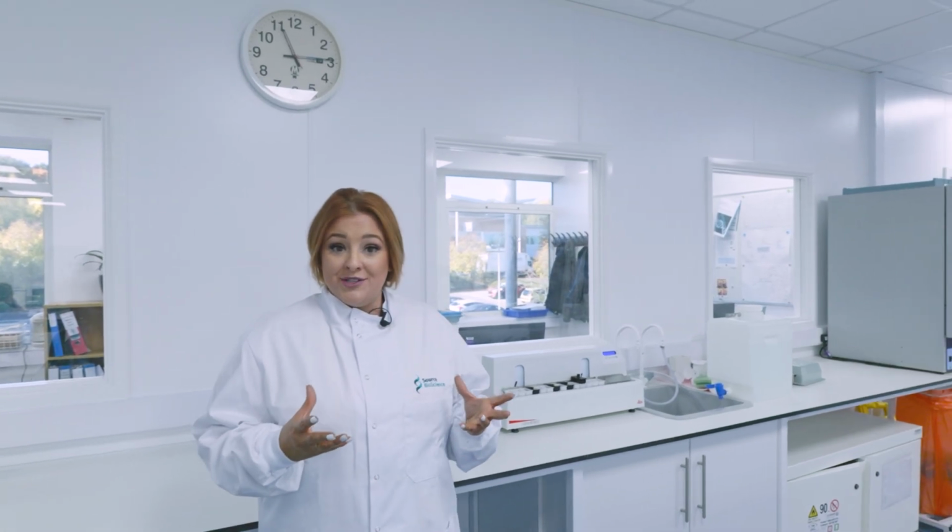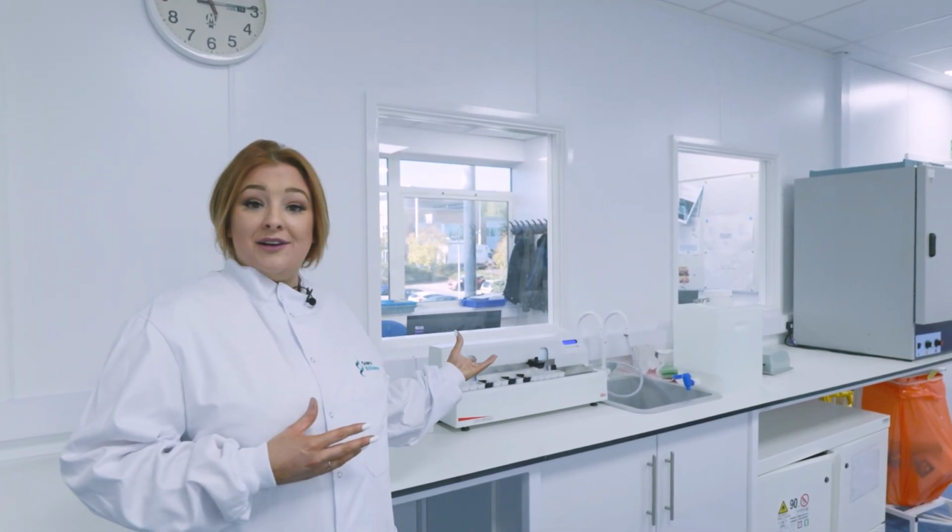So once we've got our unstained slide, it then gets sent down an H&E stainer. So this allows us to have a look at the tissue architecture and also to identify invasive tumour and areas of interest. This allows us to do tumour burden review for mutation analysis. It also allows us to know whether we need to macro out certain areas in order to get the best possible test for the patient.